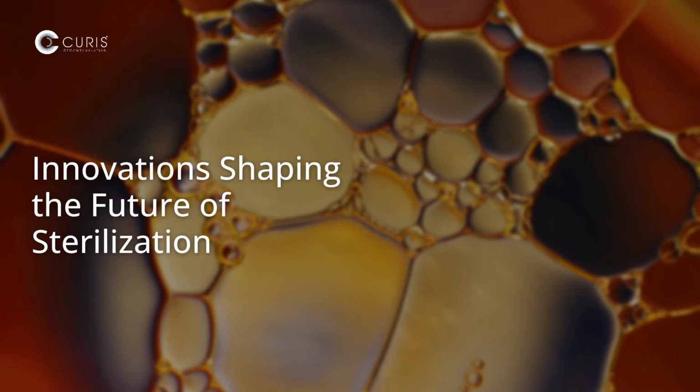Modern sterilization technologies are advancing rapidly to meet today's aseptic demands. Vaporized hydrogen peroxide systems have become a preferred alternative due to their ability to evenly decontaminate entire spaces.